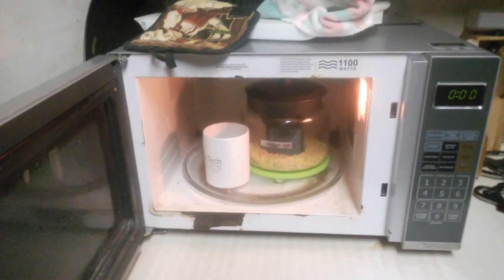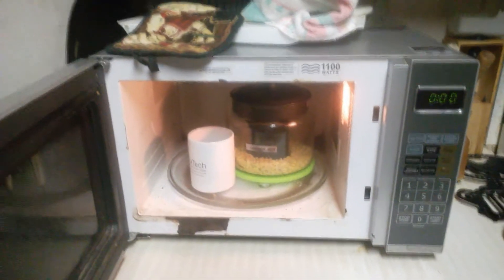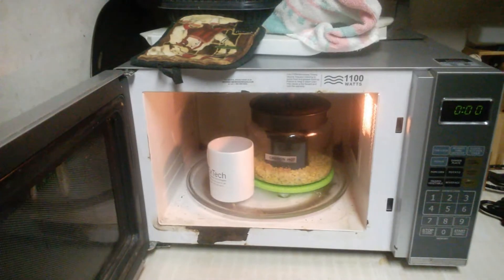Okay, so it's finished. We're going to let it sit for about 5 minutes because it's still really hot, so we'll come back once it cools off.